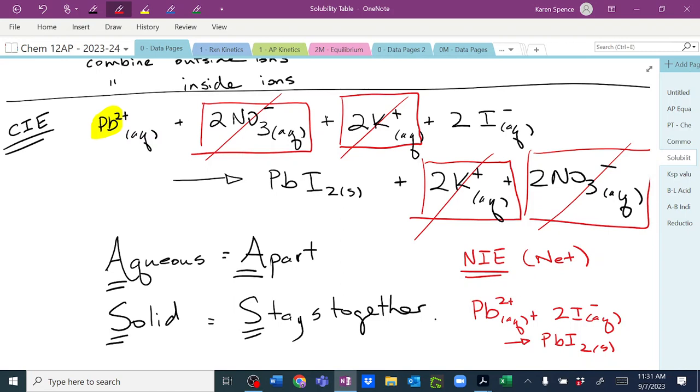we're doing it now is that we're going to be measuring reaction rates. And when you look at a reaction, you need to be able to tell me, could I measure a change in concentration of the lead? Yes. Why?